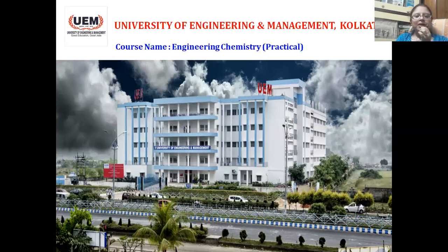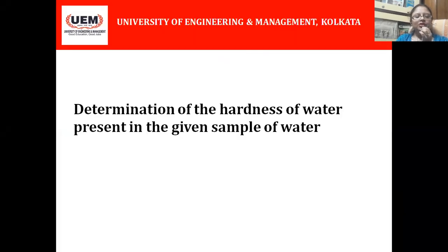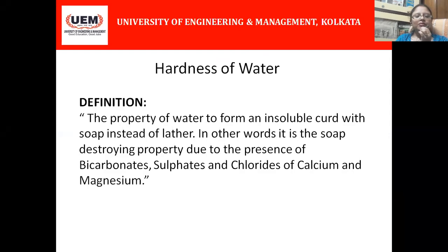Today I will discuss some practical session related to engineering chemistry. Today my topic of discussion is determination of hardness of water present in the given sample of water. So first of all, we want to know what is hardness of water.